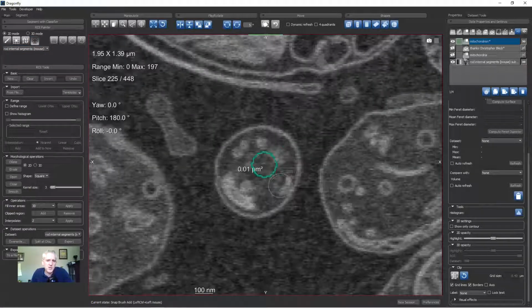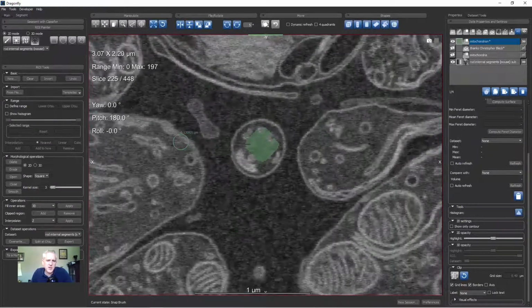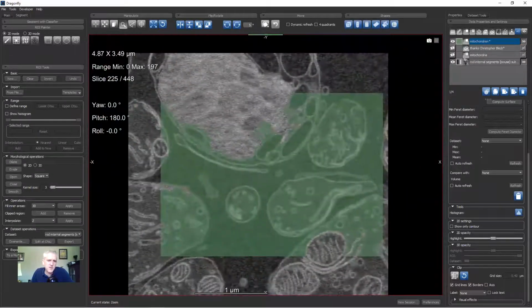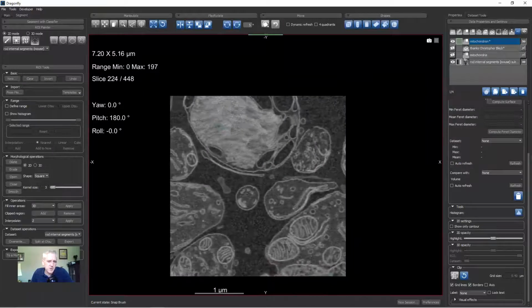So I can click and drag, and it will drag out. Now, the initial selection, I think, is based on how big your cursor is. So it's not going to be so good for these biological data, obviously, but you can use this sometimes when you need to do sort of a region growing tool. So this is an option, but again, it's only working in 2D.